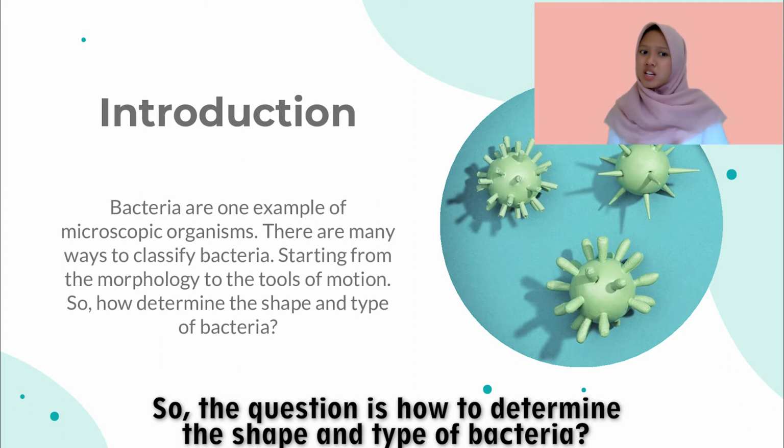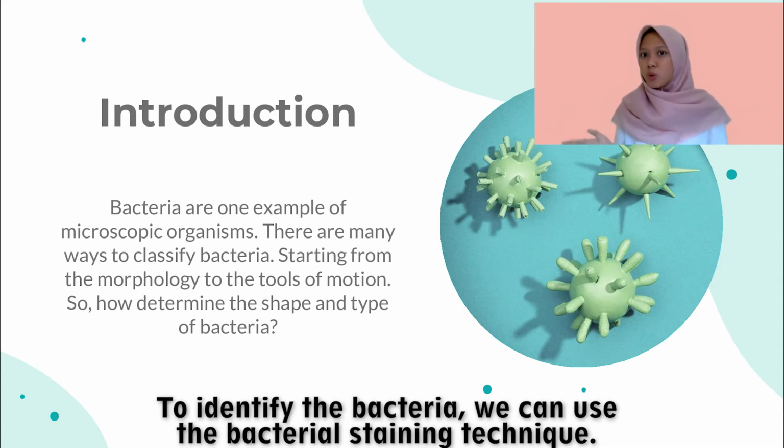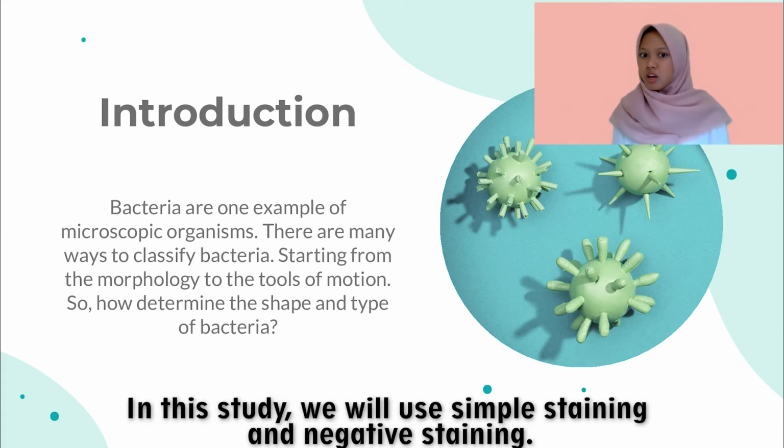So, the question is how to determine the shape and type of bacteria? To identify the bacteria, we can use the bacterial staining technique. In this study, we will use simple staining and negative staining.